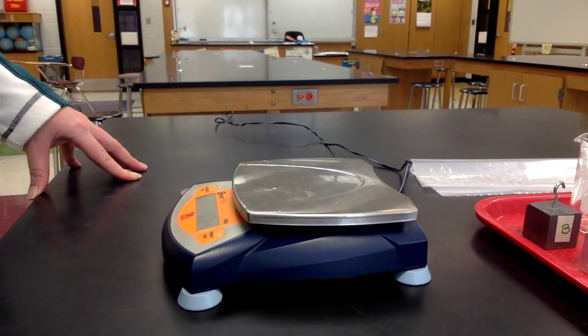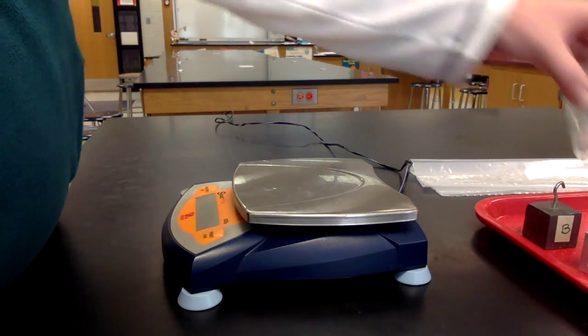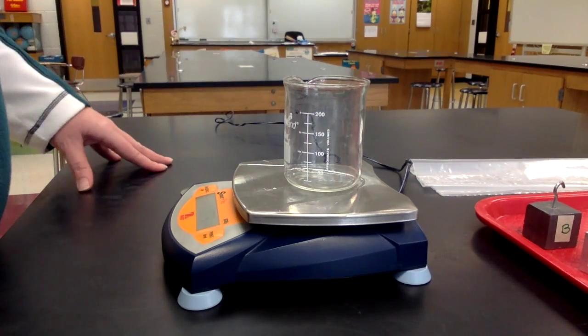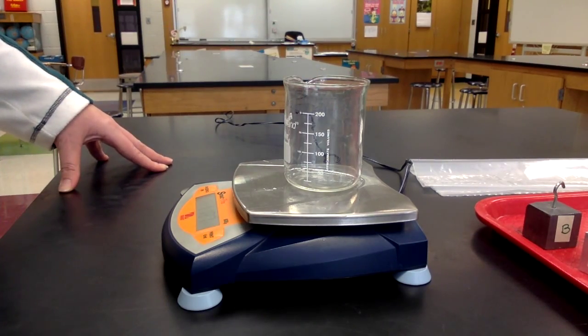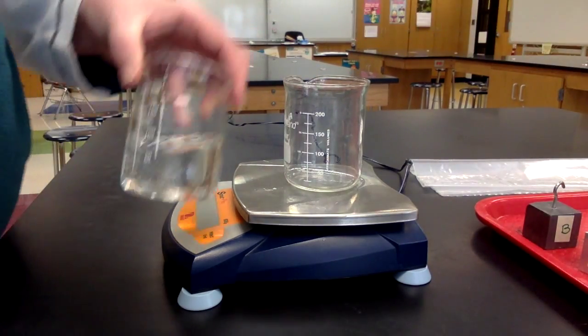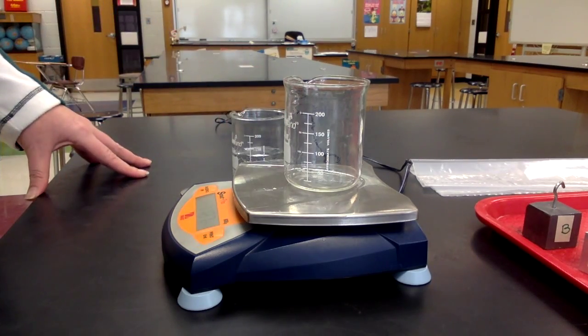To measure the mass of a liquid, you must first measure an empty beaker. This is the container that the liquid will be in. Record that number.